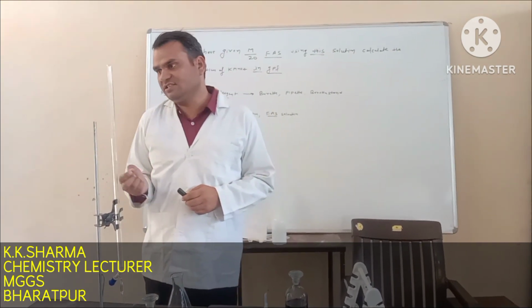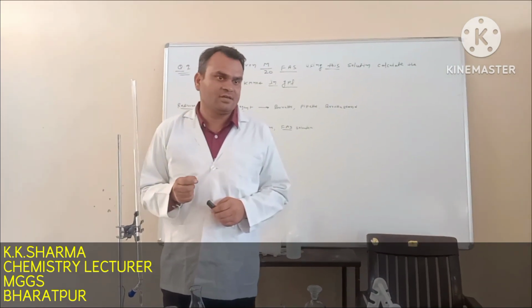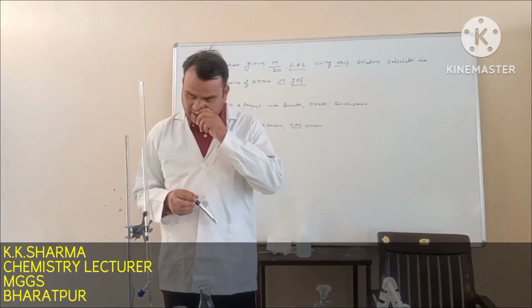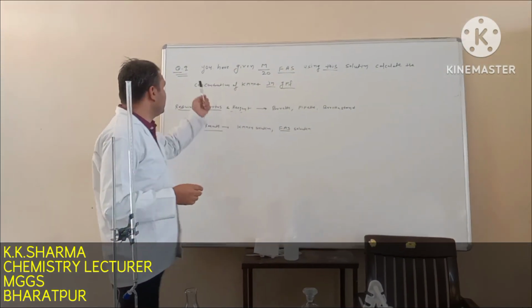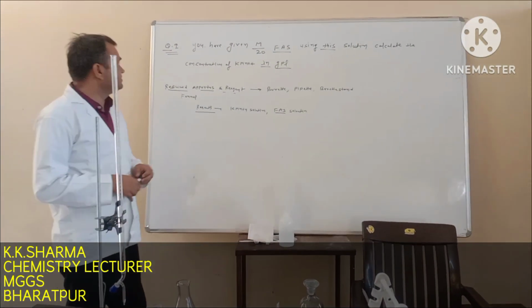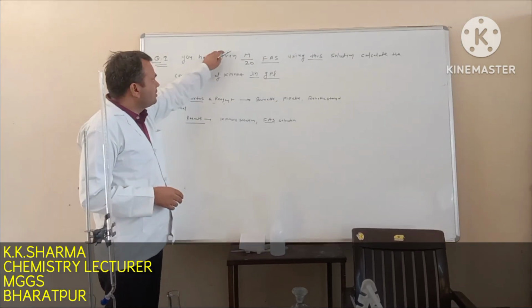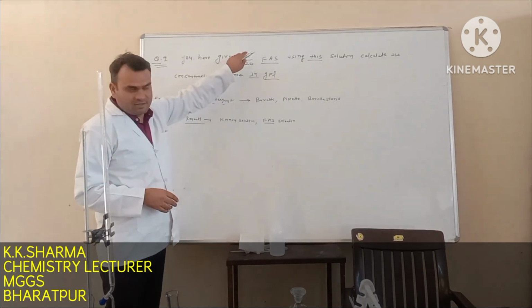One solution's concentration is known, and another solution's concentration should be calculated. So you are given a question for this exercise. You are given M/20 FAS.